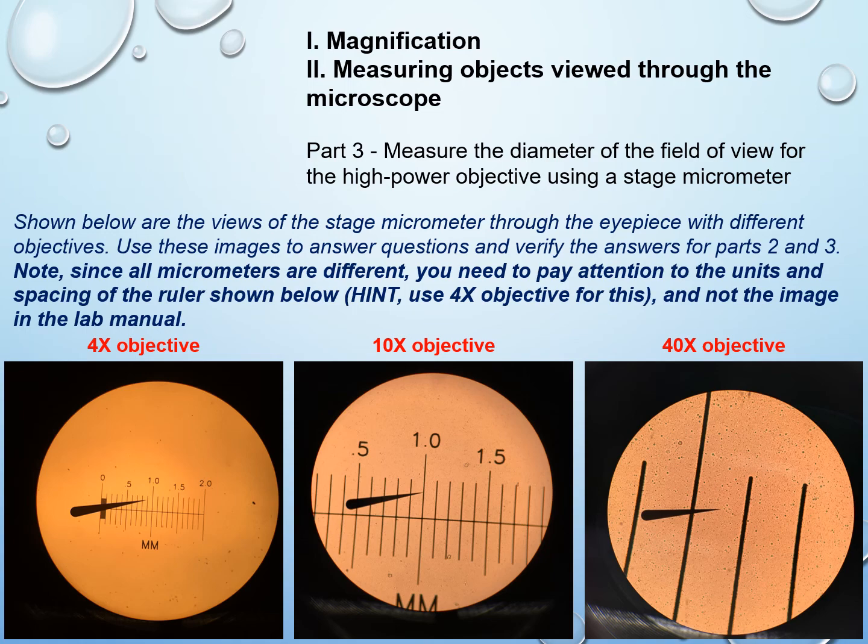So you will use these images that I showed on the previous slide and this slide if you're doing this lab remotely to actually answer the questions in the first 3 parts of the lab. But of course, if you're doing this lab in person, you will get to see your own images and can answer the questions that way.